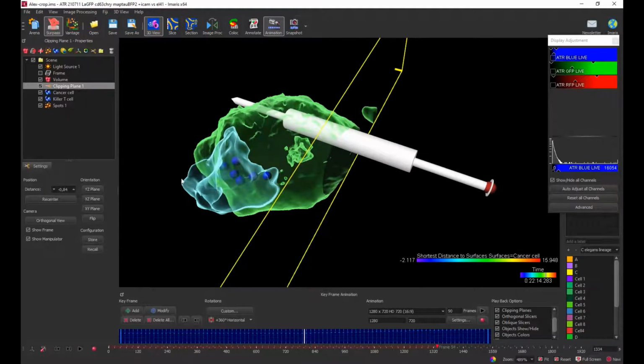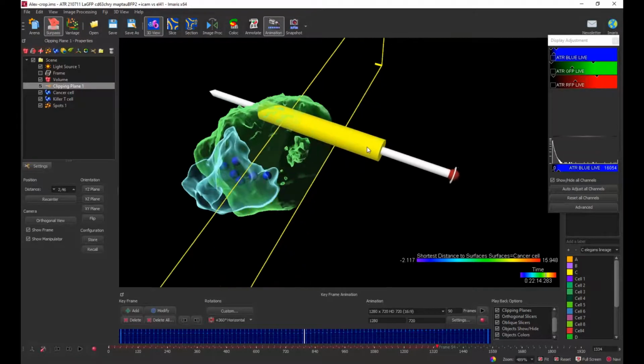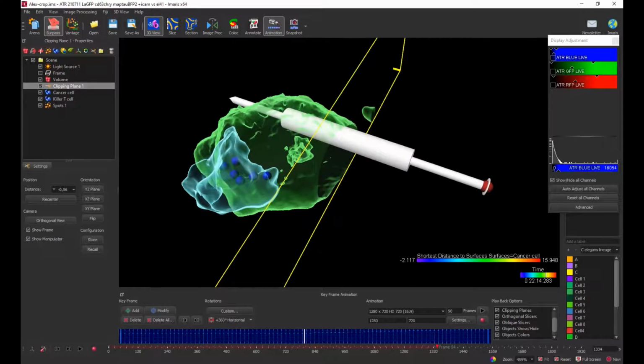Okay, so I hope it was understandable. Yeah, no, I think that's good. Yes, the original data is there. It's just hiding it from us, essentially, in the visualization only.